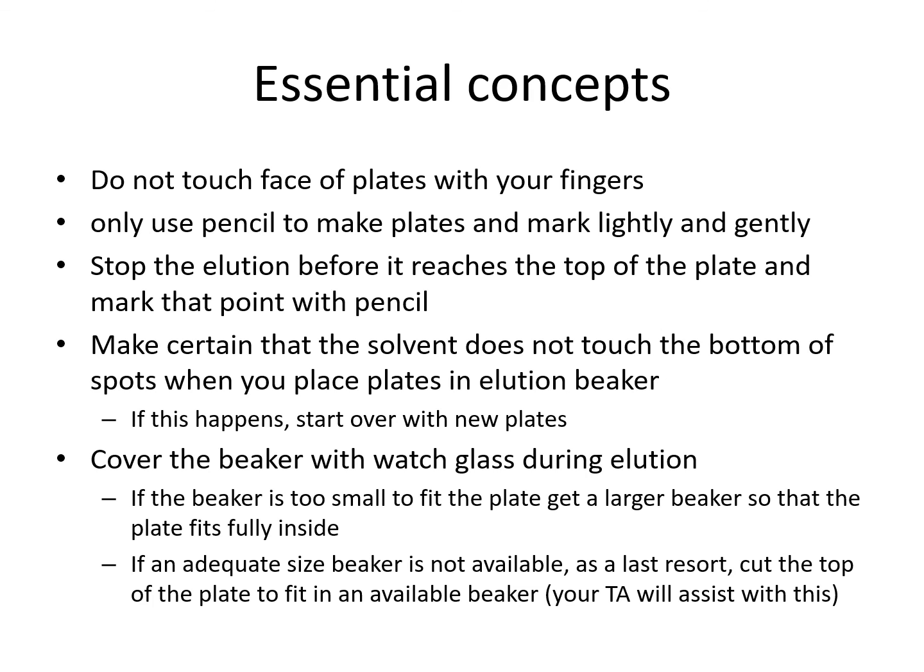And sometimes it appears that the thin layer plates are longer than the actual beaker we're using, and in that case you may need to cut the plate so that you can cover the chamber nicely.